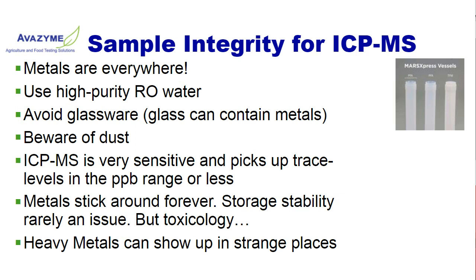What's more important is accumulation. If it's leaching from the storage container that you're performing a storage study in, then you can increase toxicology because of the cumulative effect and the fact that these metals are everlasting. And so we always are on the lookout for contamination, and it can come from anywhere.